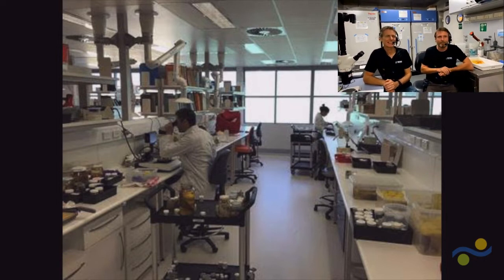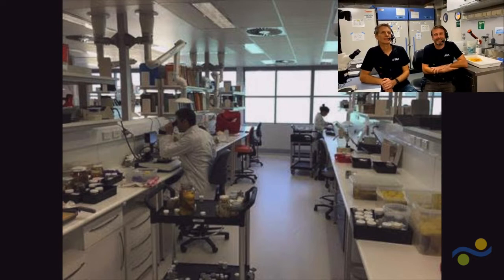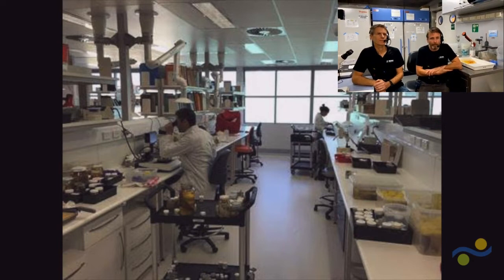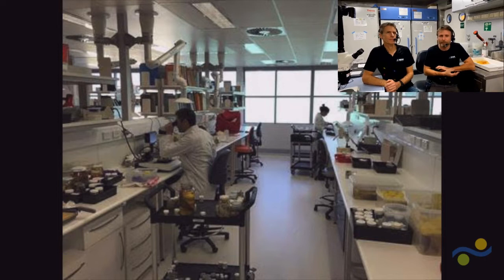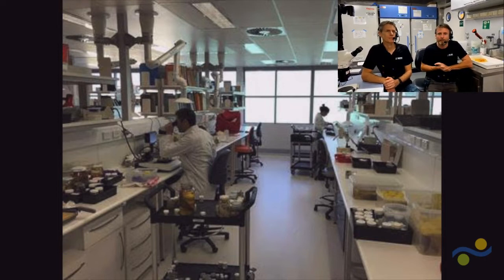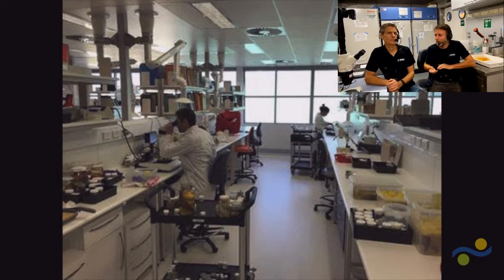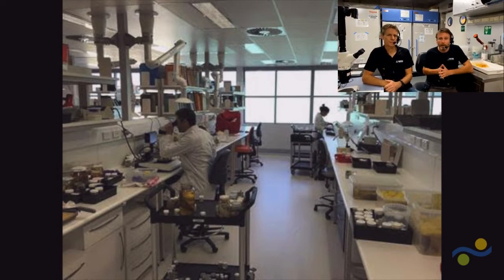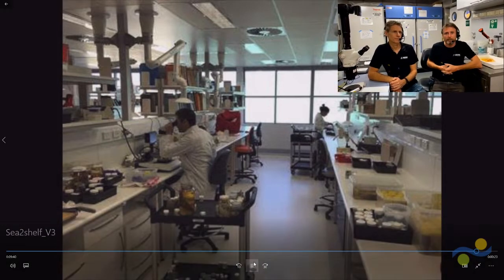Can you guys tell us what we're looking at here? What is this, a laboratory that you actually take these specimens back to keep working on them? That's one of our wet labs back at base, where we'll certainly be sitting many hours on the microscope, like Mark here on the left of that photo, identifying these specimens, sorting them out to work out what they are, and where we start formalizing the discoveries that we're making out here.